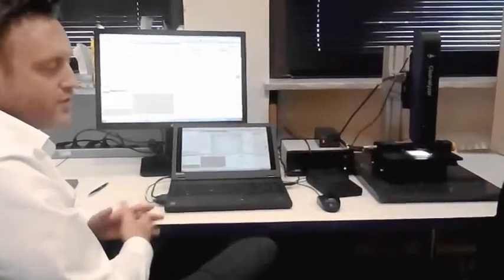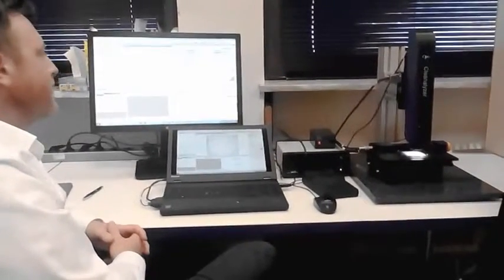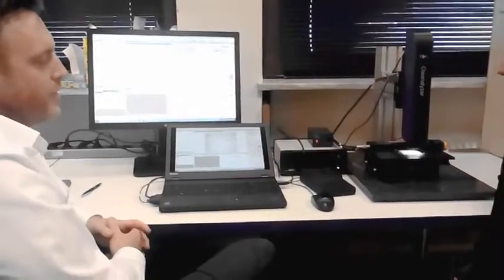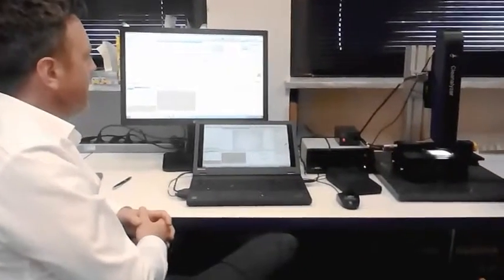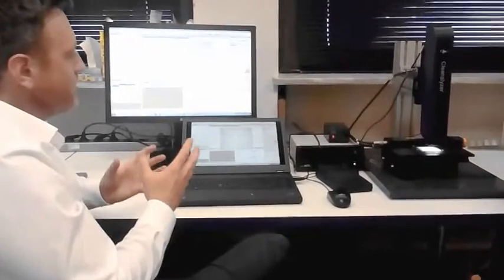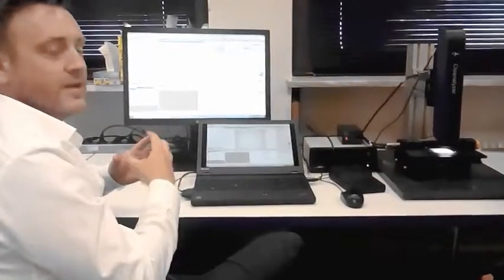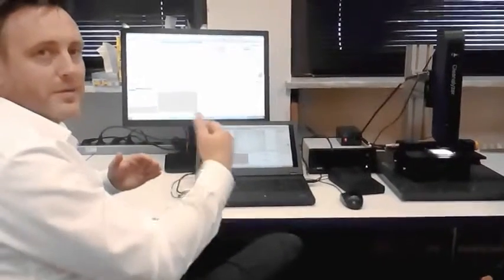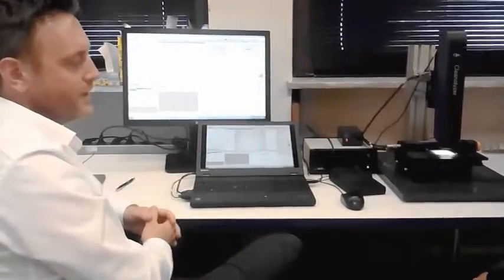So in the automotive industry, these would be ISO 16232 and VDA BD19, both of which the system is fully compliant with. In addition to that, you are able, as I mentioned, to create your own standards. So if you wish, you can create a standard which even exceeds those standards if you want to go past those, and the system will help you to do that and to build a roadmap of quality.